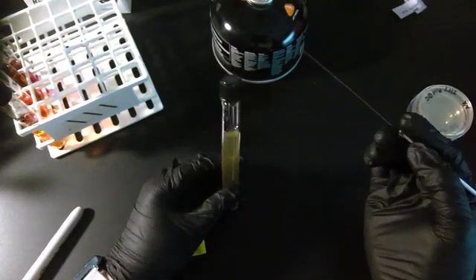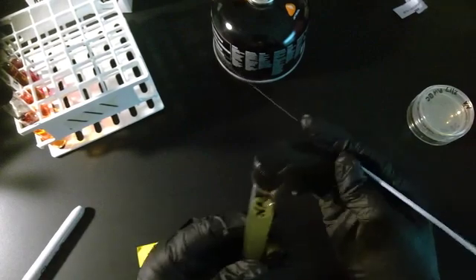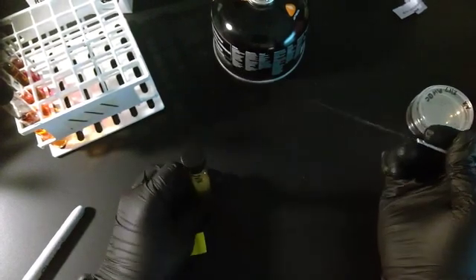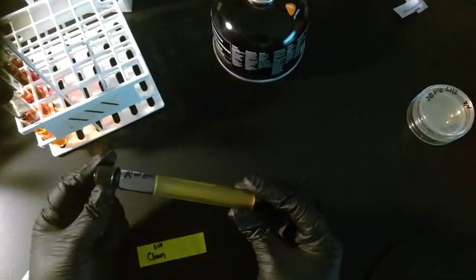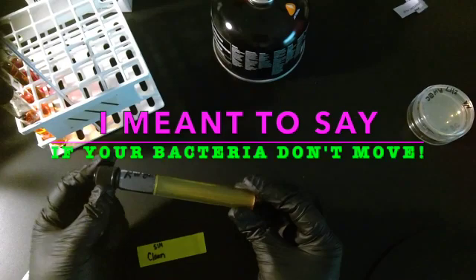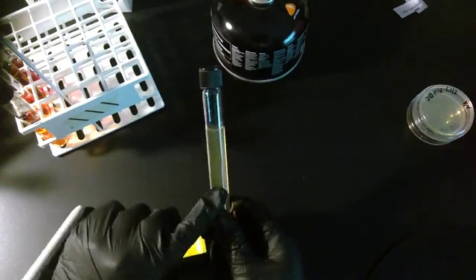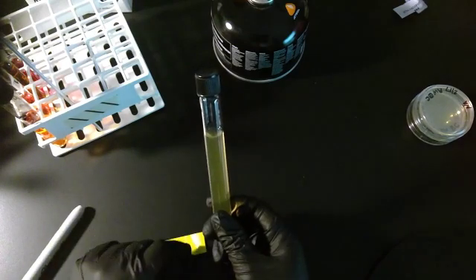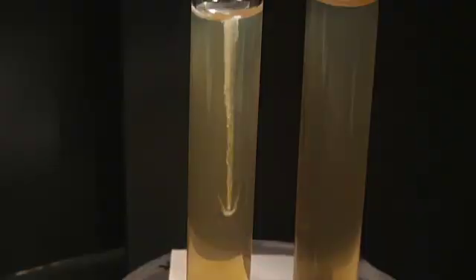When you do that, that wound that you created in the gel will be visible when your bacteria grow. If your bacteria do not grow, if they just stay in the stab that you make, you'll see a line dead center in the middle of your sim agar, and that's all you'll see.